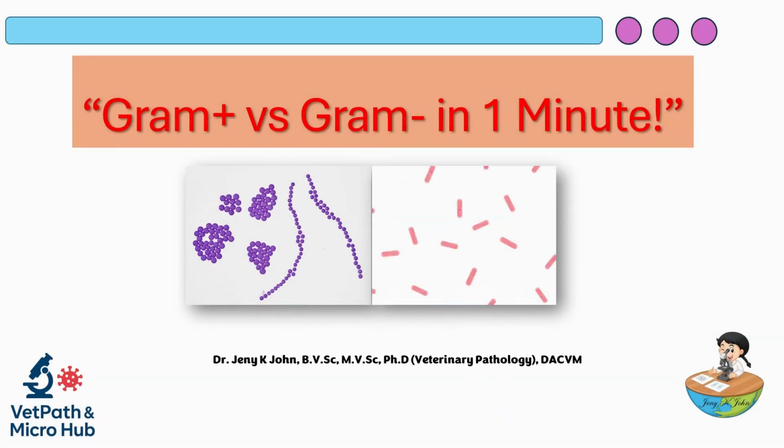Hi everyone, today we are learning the difference between gram-positive and gram-negative bacteria and how to identify them using the gram staining procedure.